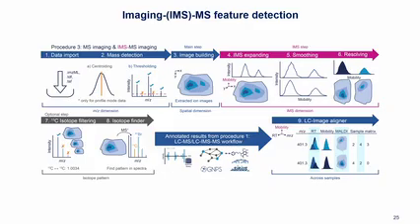So we have the module that's indicated by number 3, I believe, the image builder, which is the module that goes through the data, finds all the masses that are present, and builds the extracted images. And then the pink part that follows, that's the ion mobility specific part, where you separate your images by the mobility dimension into individual extracted images for individual peaks in the mobilograms.